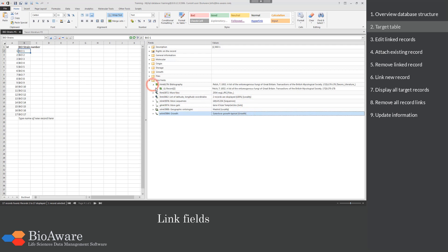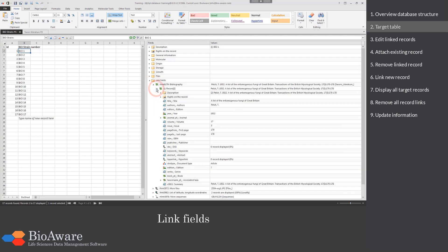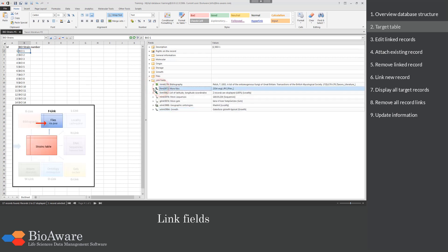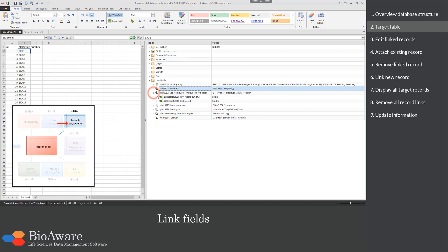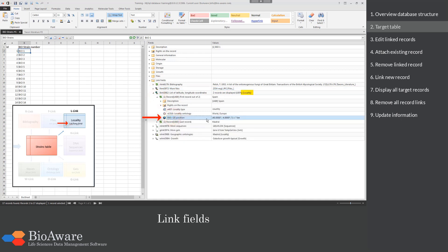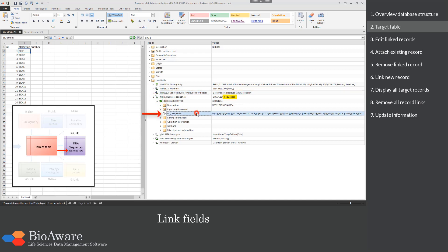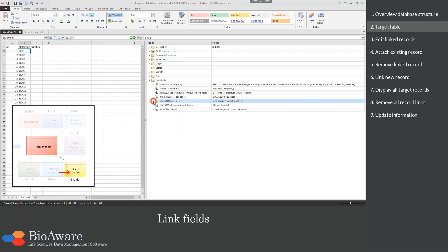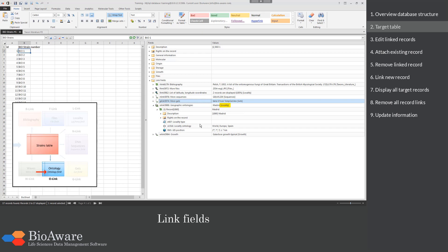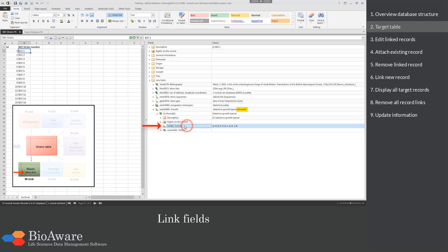When you click on the arrow in front of the link field you can see which records are linked. Click on the arrow of the linked record to see all its information. For the F-link field you can see there is a file field in the files table. For the L-link field you can see there is a latitude-longitude field in the locality table. Similarly, other link fields point to their respective target tables containing sequence, gel, ontology, and wave fields.